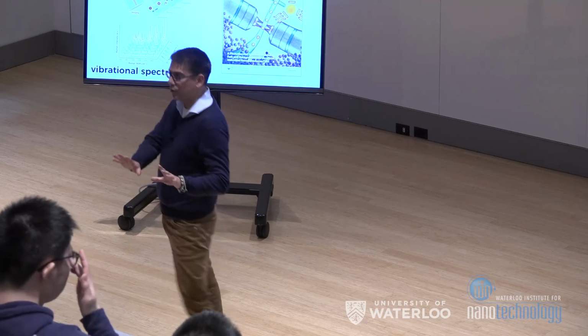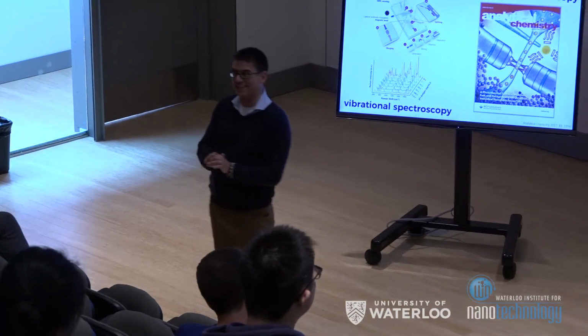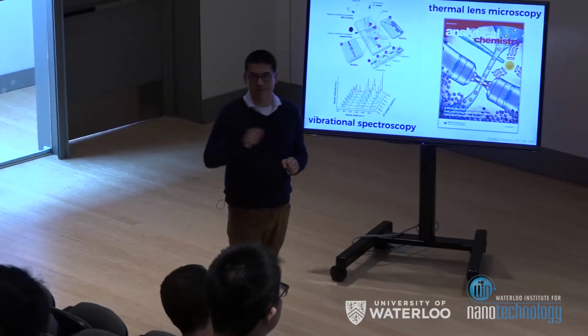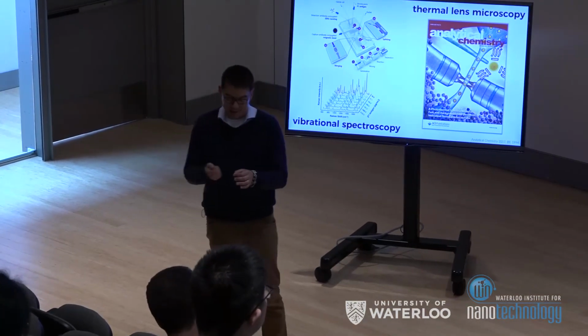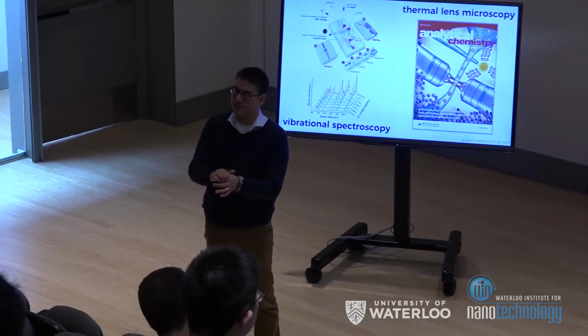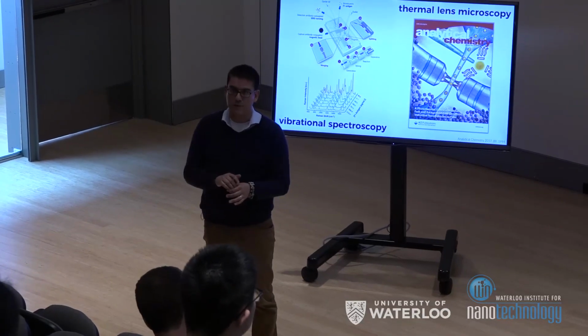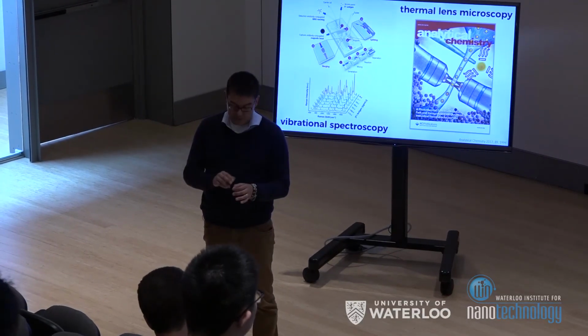Now, I've been very economical with the truth today in telling you that droplets are isolated. Droplets are isolated under certain conditions, and that means that at least on the timescale of the experiment, if everything's inside, that's a good thing. But again, the surface or the interface there is probably the most critical thing in droplets, and really understanding how we can control that.